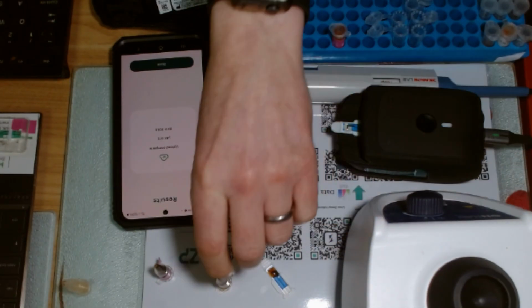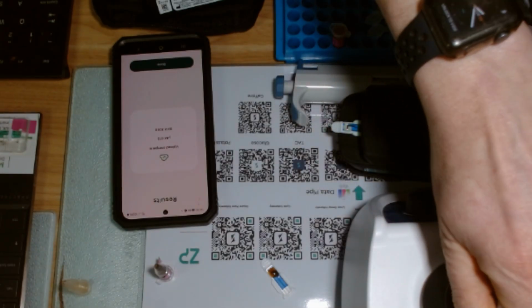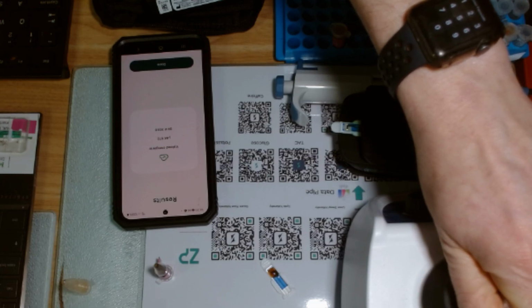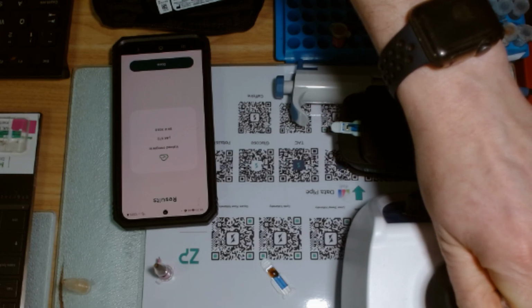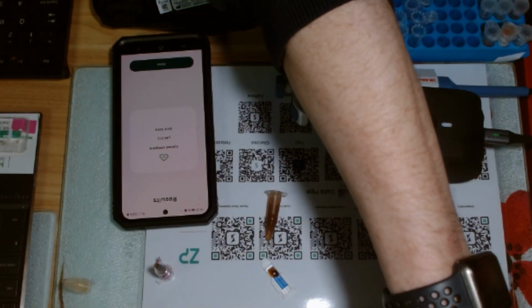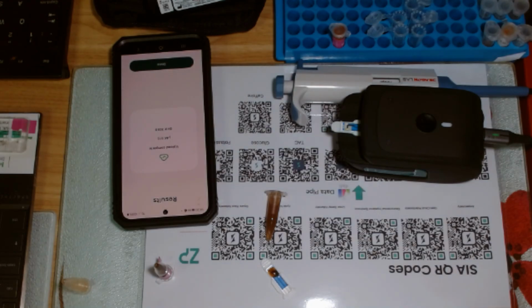These are important because they really allow for extraction. They're not that expensive, about $100 maybe, and it vibrates like crazy, and really shakes up and helps with the extraction. So just to be very clear, the workflow is 50 milligrams per 1 ml of buffer.